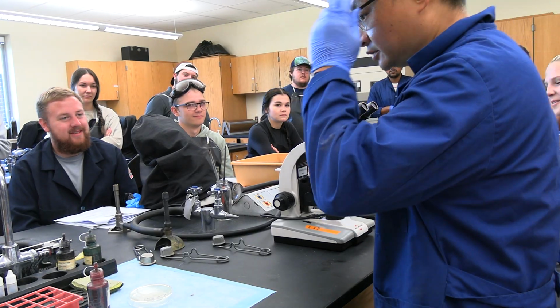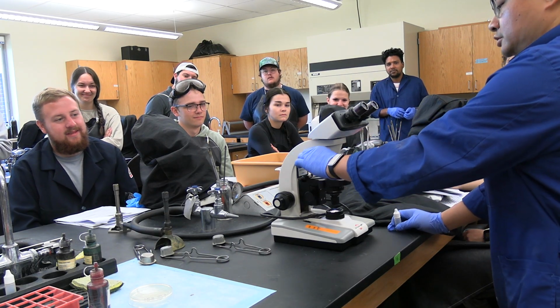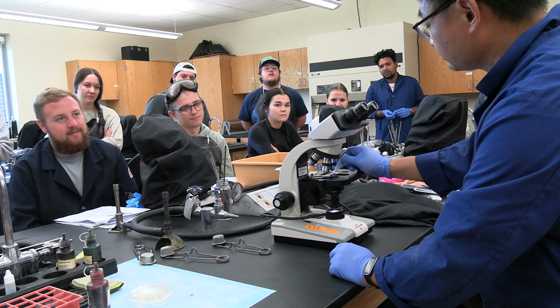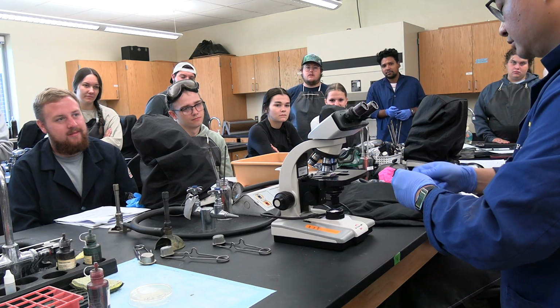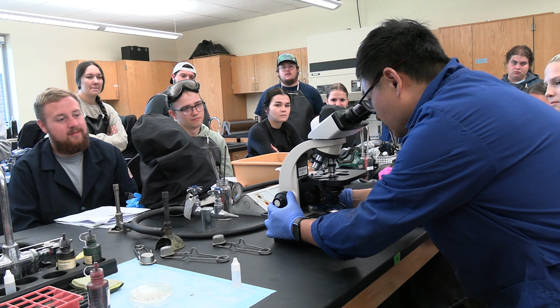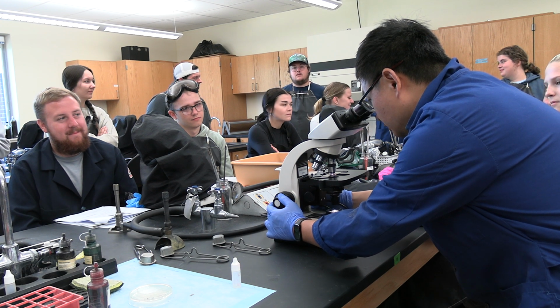Okay, what we do? Let's try whether 100x is working. If it's not working, it's okay. One twisted, two twisted, you have an angle there. So we're going to add one big drop of the oil. That's called oil immersion. So we learned about that. Remove the air gap. We put a big one. We'll see whether it works. Maybe it's not. Maybe it's yes. Oh, maybe it works. Oh, it works. Good. Oh, it looks good.